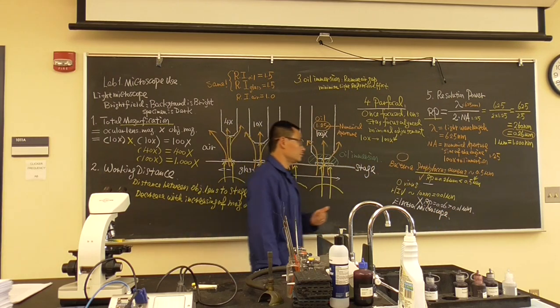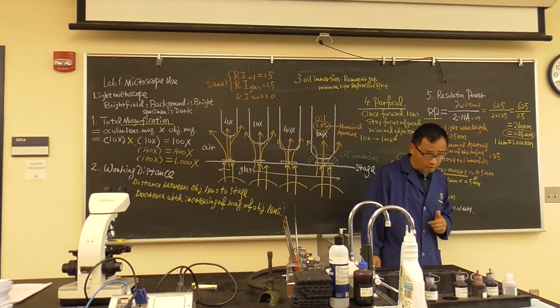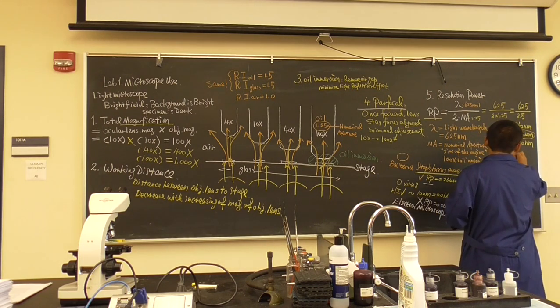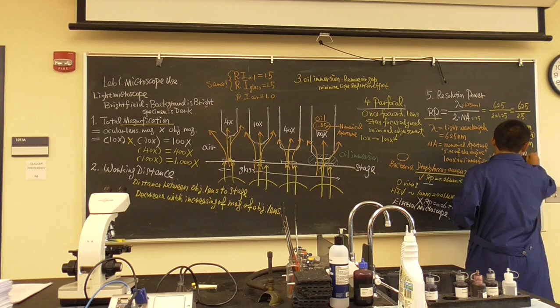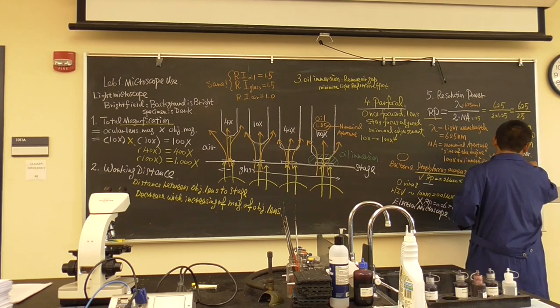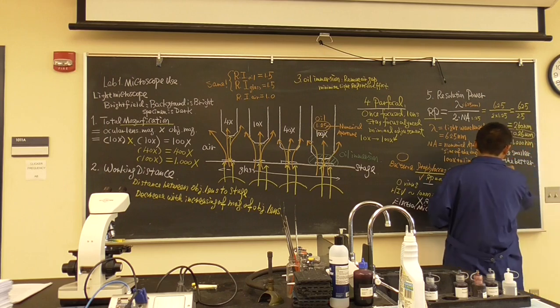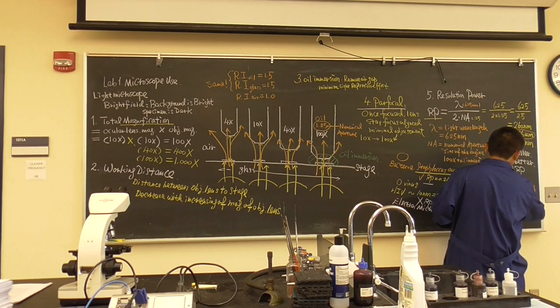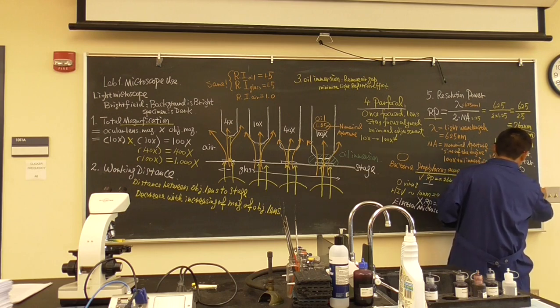So here, the resolution power should be the smaller the better, because small resolution power indicates big resolution capability.